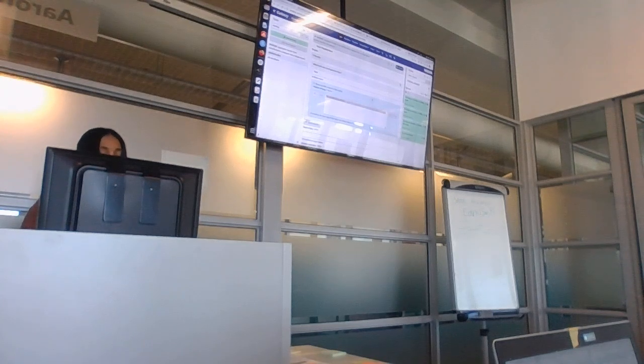You have to choose the tool that you used to generate this data, and you used fastp. And again, look for data set collection, and you will see it automatically populates it with a JSON report.